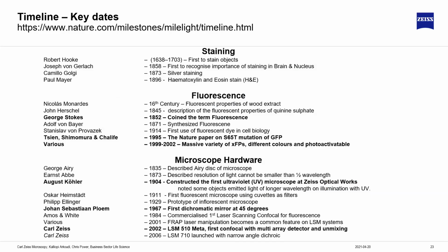So if I come back to the history slide here, what was fundamental was that in the 60s, 70s, we were all just using fluorescent dyes. FITC, fluorescein, which was discovered in 1871, was still the most commonly used dye up until 2001. So for over 100 years, it hadn't really changed. Eosin was quite commonly used. Not a lot had changed. And the reason it didn't change was it kind of worked, it labeled, it was bright, who cared?